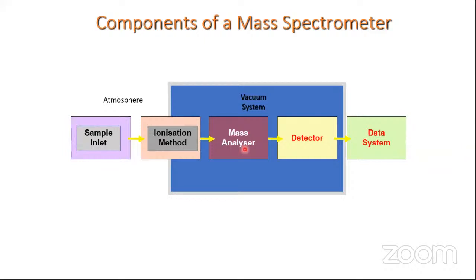Whatever is coming should be charged, and it should be in vapor form. Remember this, it is a very important piece of information about the analyzer.